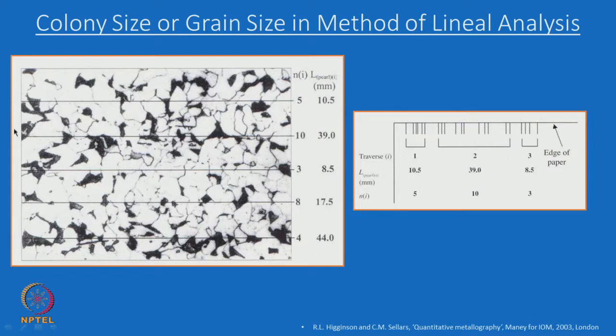So, for example, if I start counting from this line, this area what you are seeing here, if I draw an edge line like this, a vertical line, that is what is shown here, this one edge, and then if I draw another vertical line at the other intersection, it is shown here, the next line. Now I will make sure that I am using a transparent sheet on this and then making this vertical mark on this micrograph.